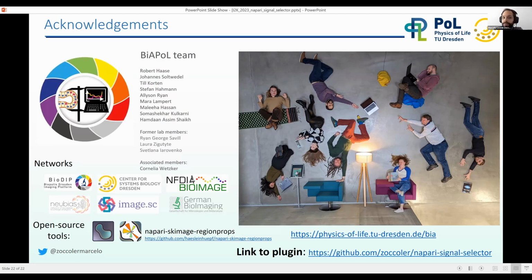So that was my idea here today. It's more like a showcase of this first release, and I did not prepare any exercises. The exercise would be to try to install it, see if the instructions are clear, and give me feedback if you can. I'm open for questions now. I think we have around 8 to 10 minutes for questions, if you have some. Please open your microphone or write something in the chat. Thank you.